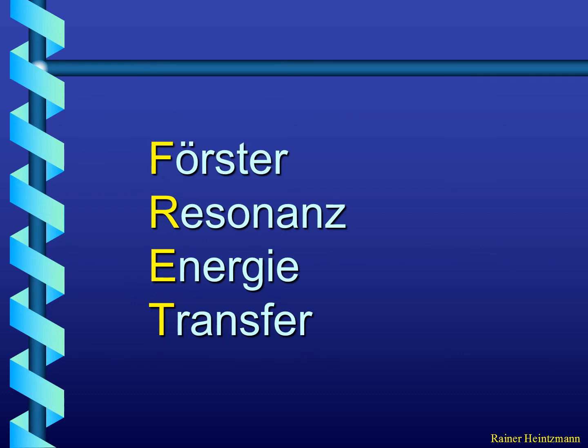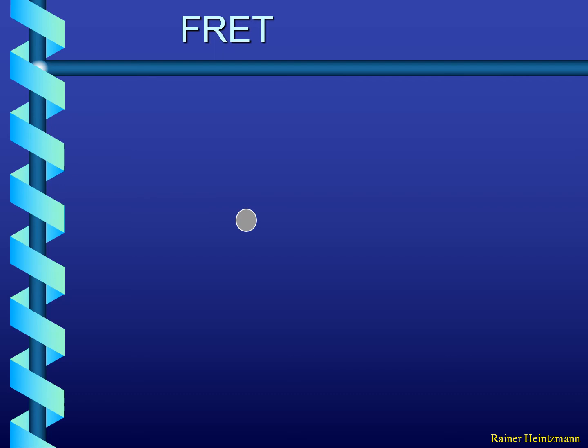So with this, I've described to you how FLIM works technically, and now we are going to look at a few applications. The first very important one is Förster Resonance Energy Transfer, and you've already seen in the talk by Daniela how this works, but I'm going to repeat the basics of it. Sometimes people also call it Fluorescence Resonance Energy Transfer, but you should really avoid this. It's a misnomer. It should be called Förster Resonance Energy Transfer. That's what the F stands for.